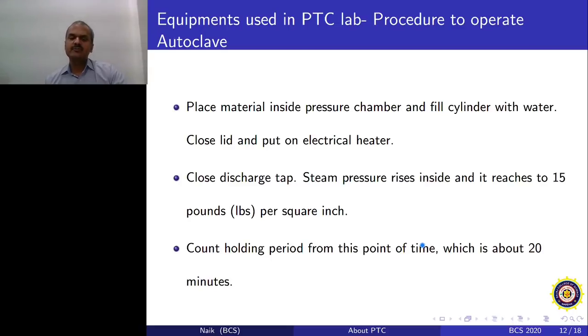So in this autoclaving timing, which we call 20 minutes or 10 minutes, is the time enough for those endospores and any other bacterial spores or bacteria which are present inside and outside the medium, inside and outside the glassware, to get easily killed. So this time is basically optimized with various experimentation.